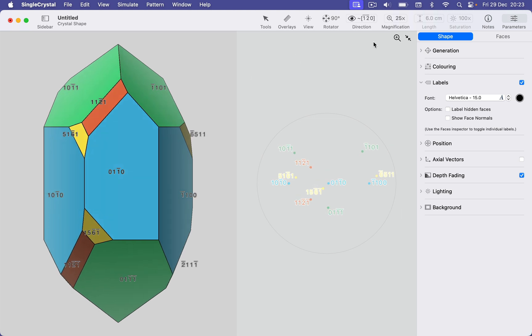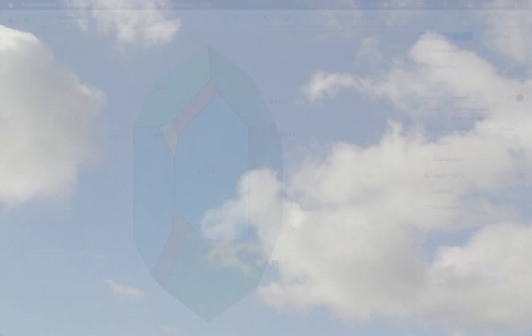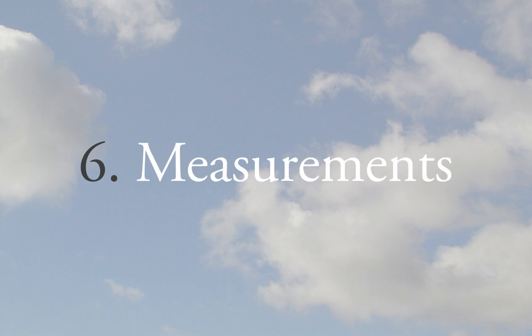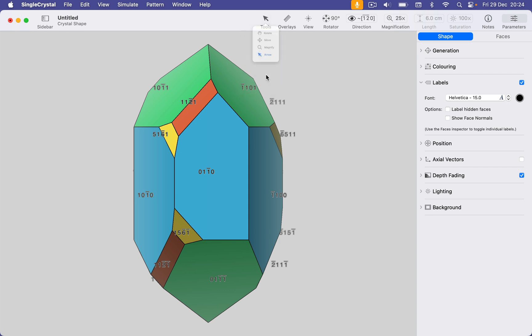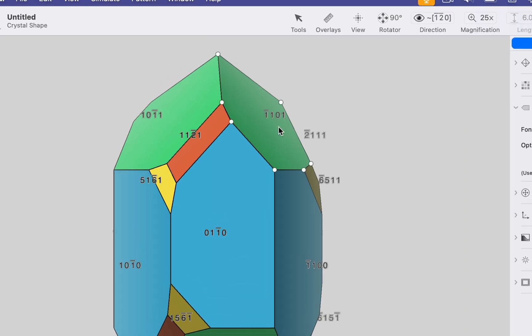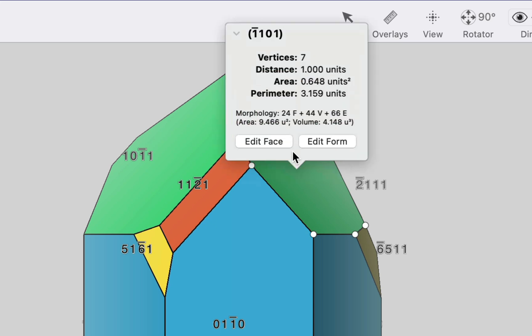And let's turn off those face normals for the moment. Now we're going to minimize our stereogram. There's the mini stereogram and I'm going to just hide that. We're now going to make some measurements on the crystal. To do this, we need to make sure our arrow tool is active. And first of all, if I hover over a face, we get a face tip that appears, which we can expand. And that gives us information about that face.